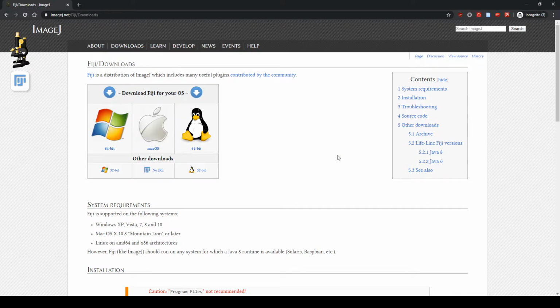The download link was provided in the email that I sent out yesterday and is also shown here. Feel free to follow along with this video with the PDF instructions that is uploaded onto GouchoSpace. And with that, let us begin.